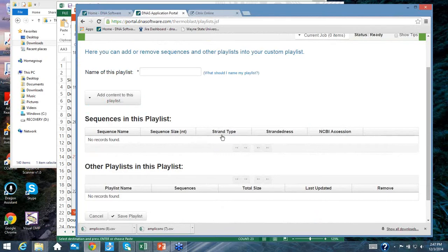Okay, the next question is, will the search report multiple hits? For example, amplicons in the same sequence. Yes, it does. They would each be reported separately. And that's particularly important when you're dealing with a large genome like the human genome. You may desire your particular set of primers to go to the X chromosome, but in fact, it might bind to some other chromosomes in the human genome, or even within the X chromosome. It will show you all of the hits that are found. As long as they're extensible, they will be shown as individual hits. If they're not extensible and they're probes, it will show those hits. If they form amplicons, it will show all the amplicons. So the answer to that question is basically yes.